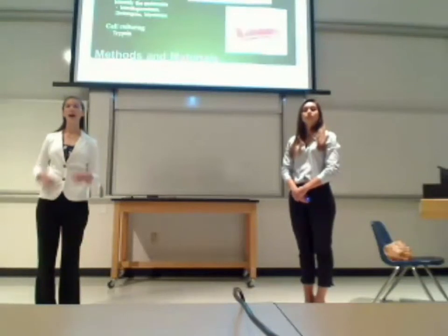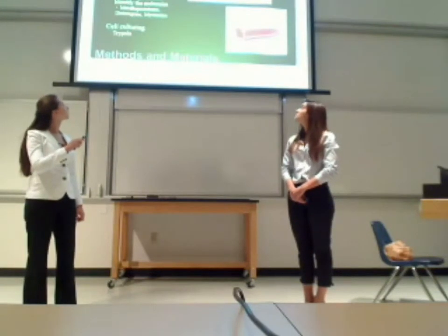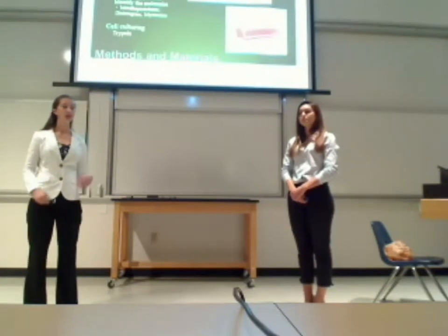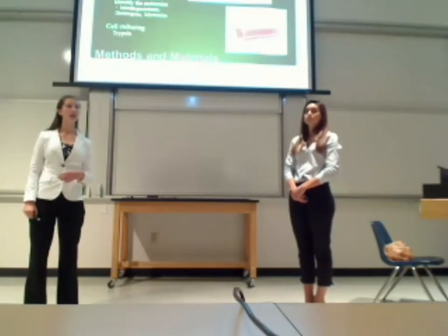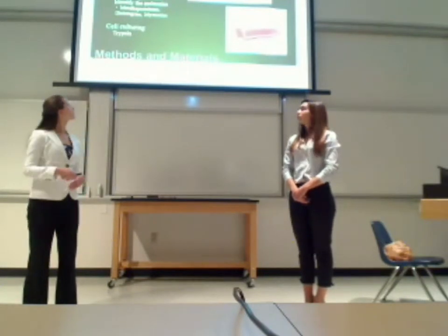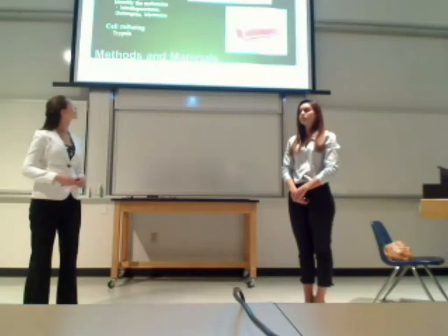So, a little bit about how we tested this venom and its toxicity towards the cells. We used what's called MTT assays, and that's seen up here. The darker purple is where there are more cells, and the lighter is where there are the least amount of cells. The reagent stains the mitochondria of the cells, and it tests their metabolic activity, which in turn gives us a good estimate of how many cells there are. After we do that, we put in a detergent, which lyses the cells so that we can put it into a plate reader and get a light absorbance reading.